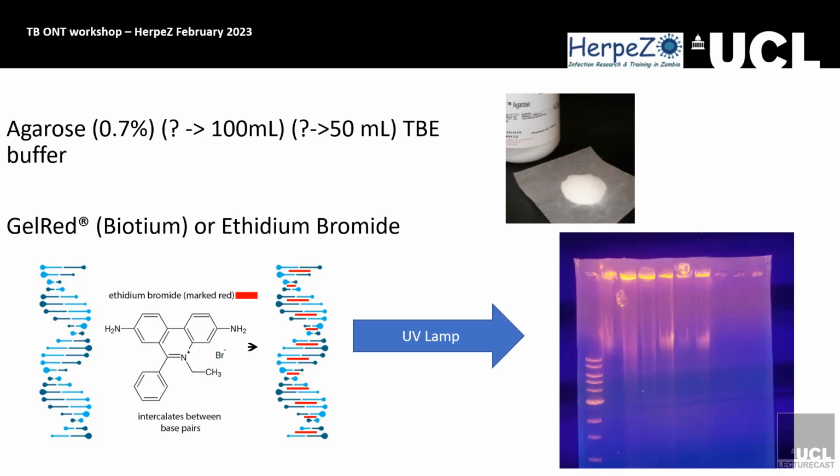That's a very bad gel, by the way. This one? Yes, don't aspire to that. It's more like a smear than discrete bands.